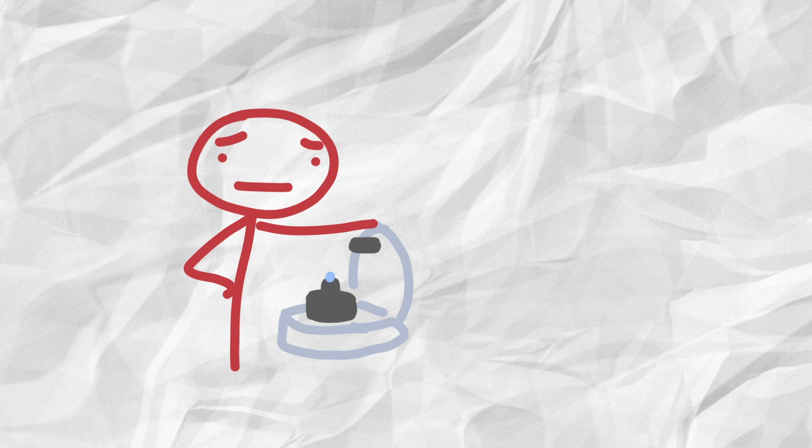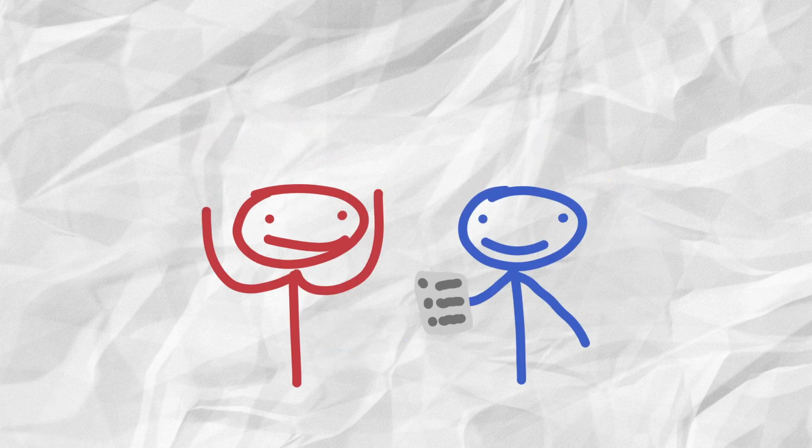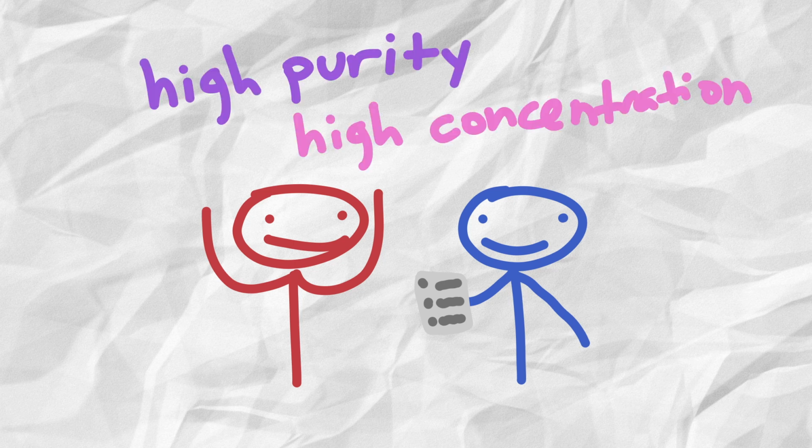We always check our nanodrop values after mini-preps. It can be stressful because it's like judgment time of your mini-prep abilities. To make it less stressful, we're going to go through a mini-prep and see what steps we can take to make sure that we get high purity and high concentration after the end of our mini-prep.